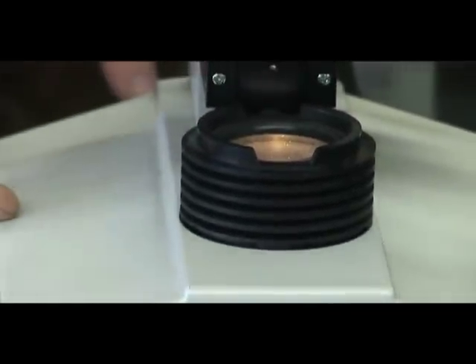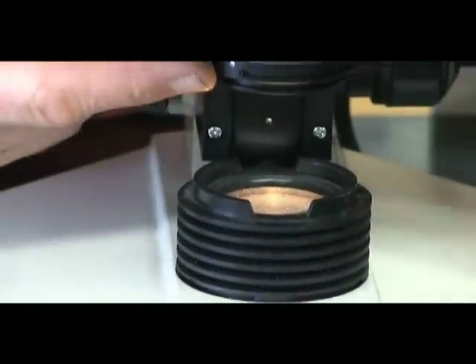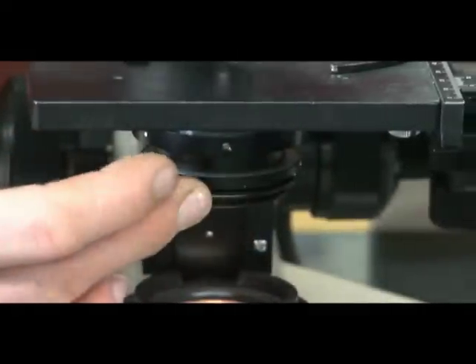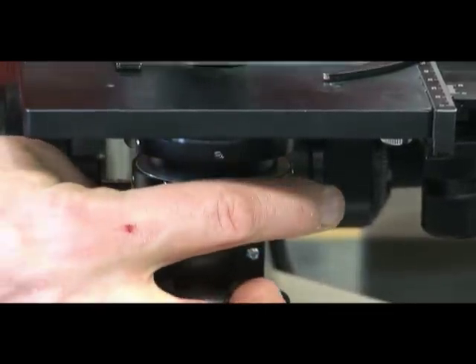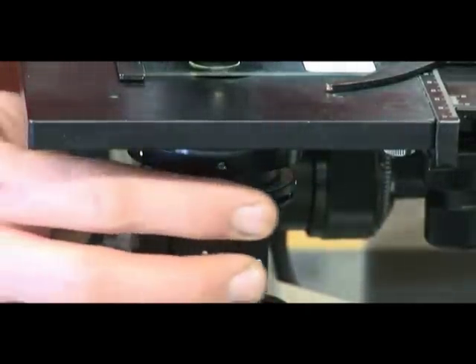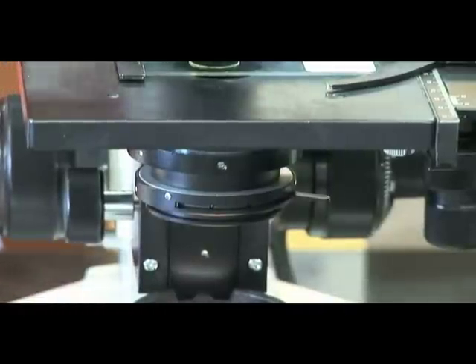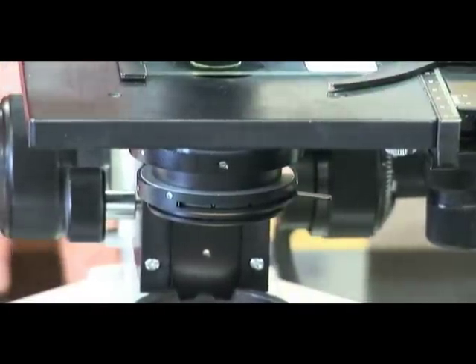If we follow the path of light to your eye, it comes out of the light source and is first focused through the bottom of the subject, and light can be reduced or increased. If I move it to the left, it reduces it with an iris diaphragm lever. If I move it back to the right, it increases the light on the subject. I put it roughly as closed as I can for the subject we're looking at here, which are sponge spicules, the sort of skeleton of a sponge.